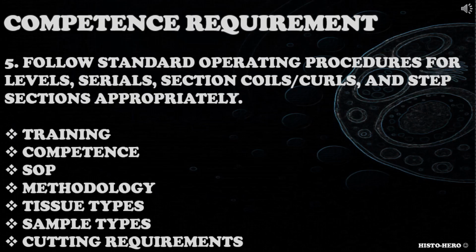When addressing this competence requirement, candidate could consider their training, competence, SOPs, and methodology used, various tissue types they can cut these sections from, various sample types and their cutting requirements.